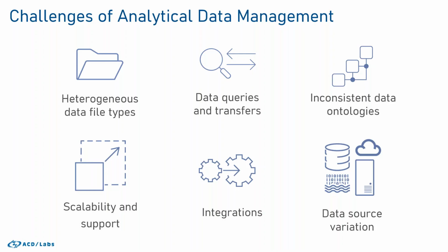We also have the issue of data source variation. The data sources themselves can be a variety of types, such as CDS systems, where the data is stored as a relational database, so you're pulling parts of data together in order to extract or visualize a complete data file. Or they could be a discrete data file that gets created and can be pulled, or it could be behind some additional security measures. So it makes it difficult for the data to be pulled into a central repository.